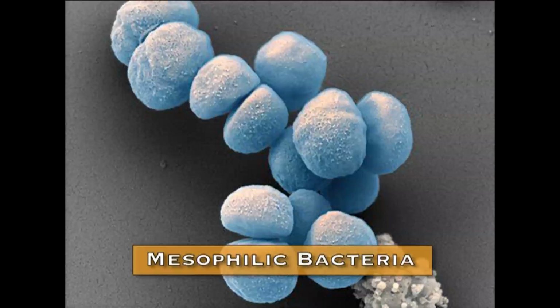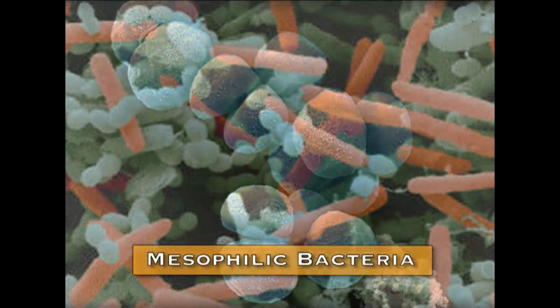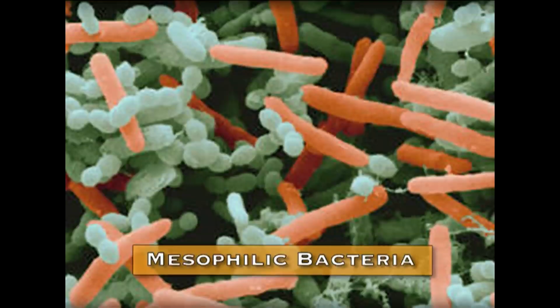Similarly, if we want to grow mesophilic bacteria, what are mesophilic bacteria? Those bacteria which grow at a temperature of 25 to 40 degrees centigrade have to be supplied with such a temperature. Otherwise, they will fail to grow, doesn't matter whether the nutrients are present in the medium. So it is not only the medium but also the physical factors.